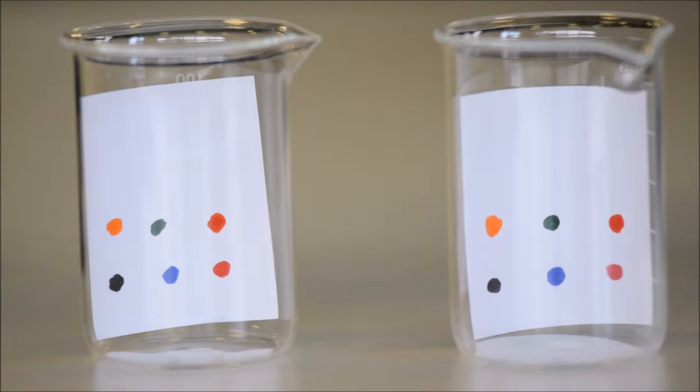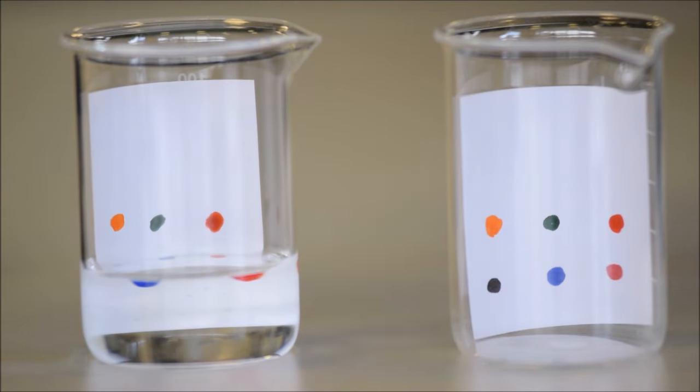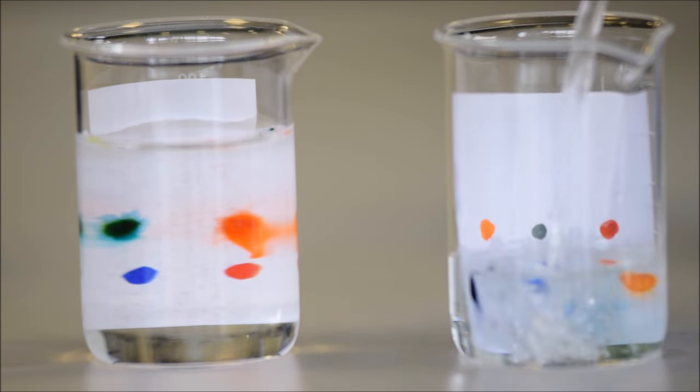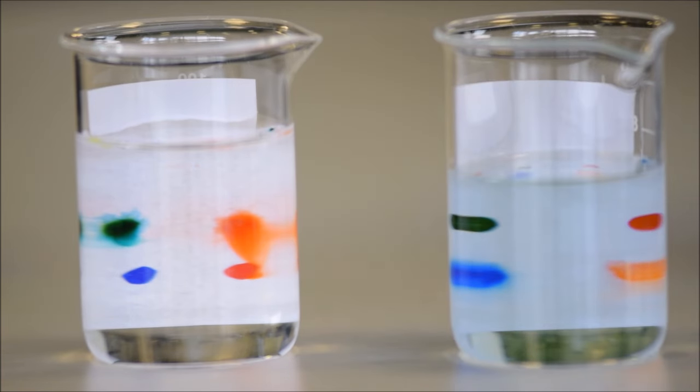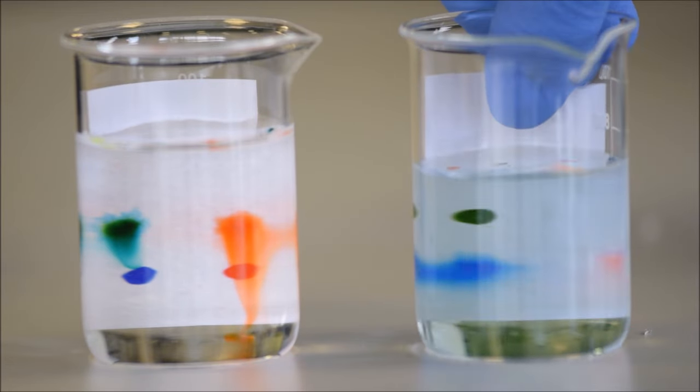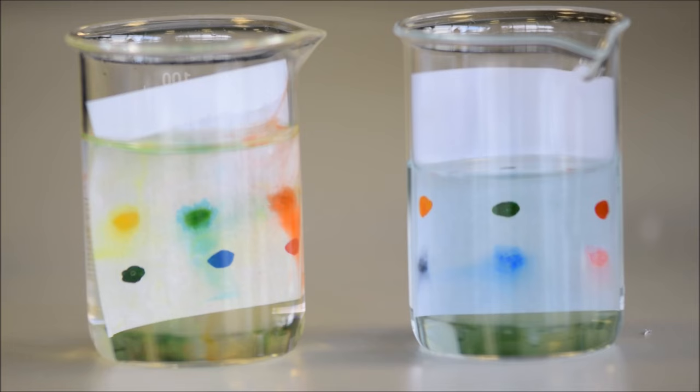Okay, one last thing I want to show you then. What I've done here is I've taken some markers. Some are permanent and some are non-permanent. On the left I've added water, and on the right I've added dichloromethane, which is a relatively non-polar solvent when you compare it to water. Half of them are permanent and half of them are non-permanent. So you might have an idea as to which ones are dissolving and which.